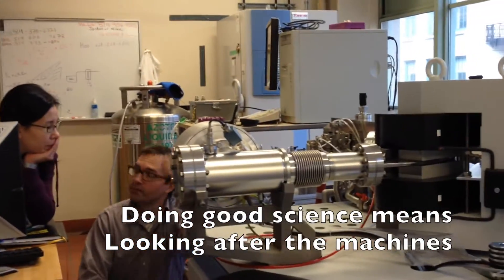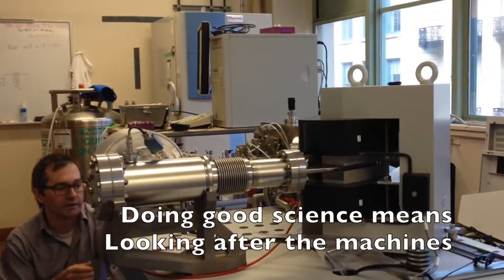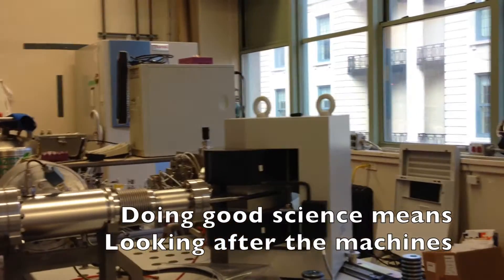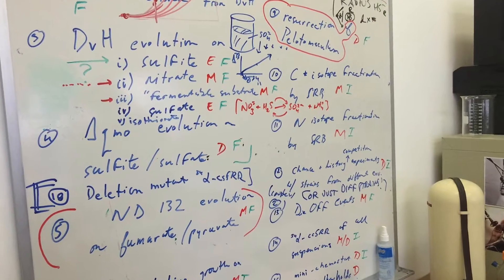In the lab downstairs, we have what's known as a mass spectrometer. And this is essentially a very sensitive way of determining the weight of a geologic sample, and not just the sample itself, but of certain elements within that sample.